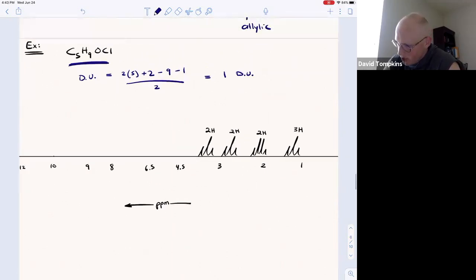So let's keep in mind that's not enough for a benzene ring, right? This time we either have a single ring, not an arene, or we could have a carbon-carbon double bond, or we could have a carbon-oxygen double bond. Right, carbon-chlorine double bonds do not form, okay, for isolable stable compounds. Chlorine makes 1 bond. It has 3 lone pairs.